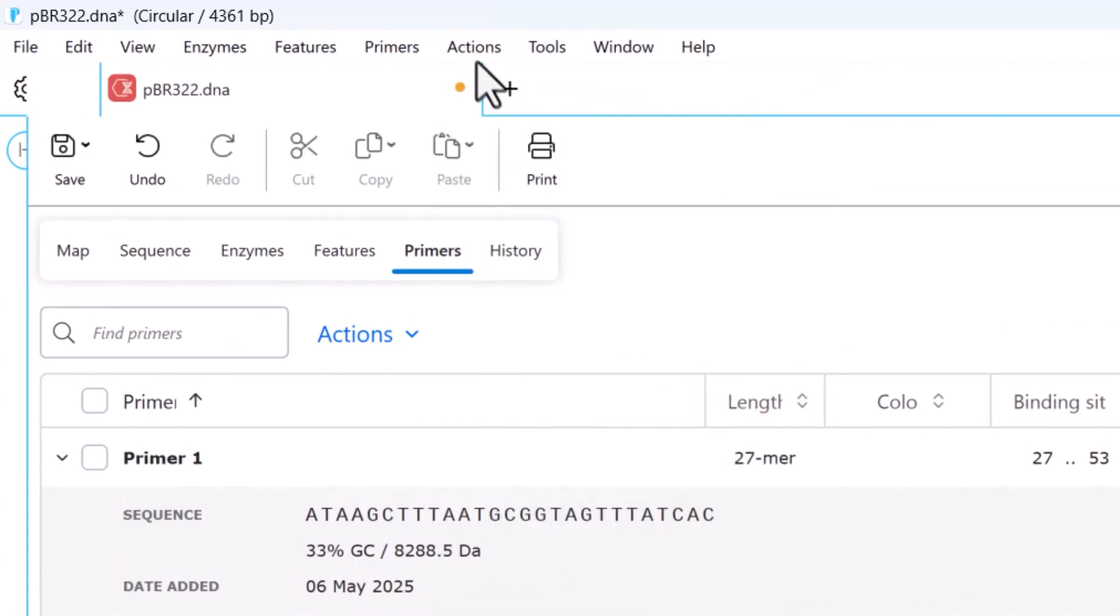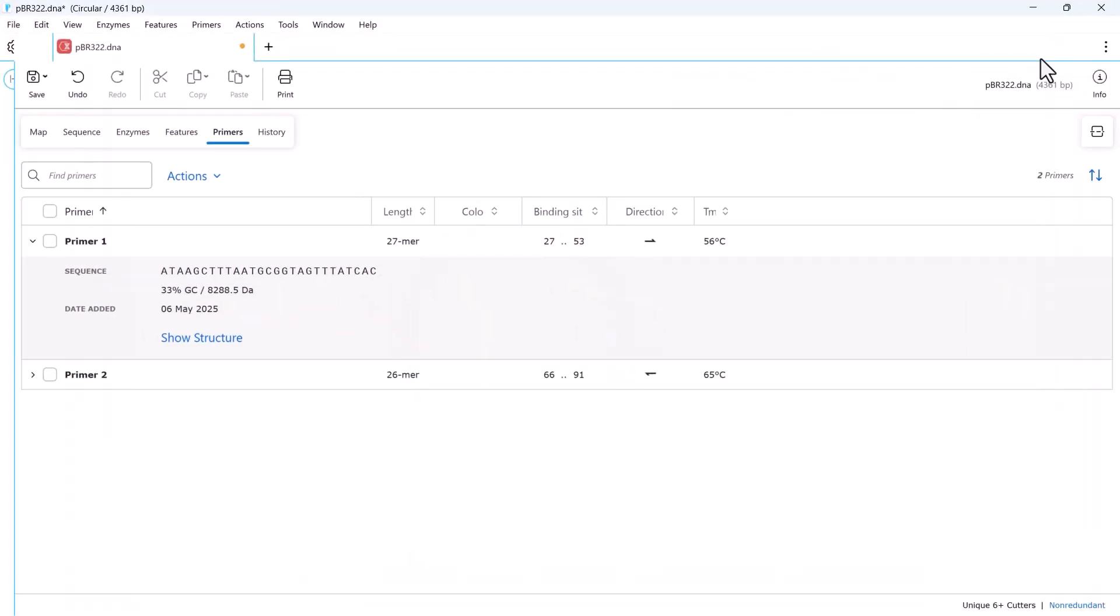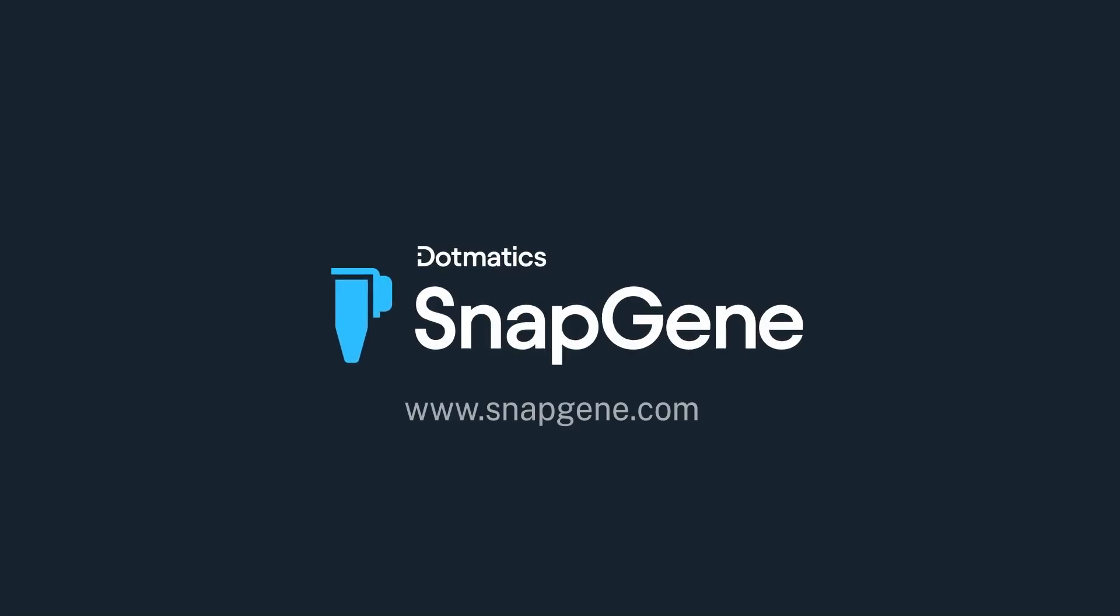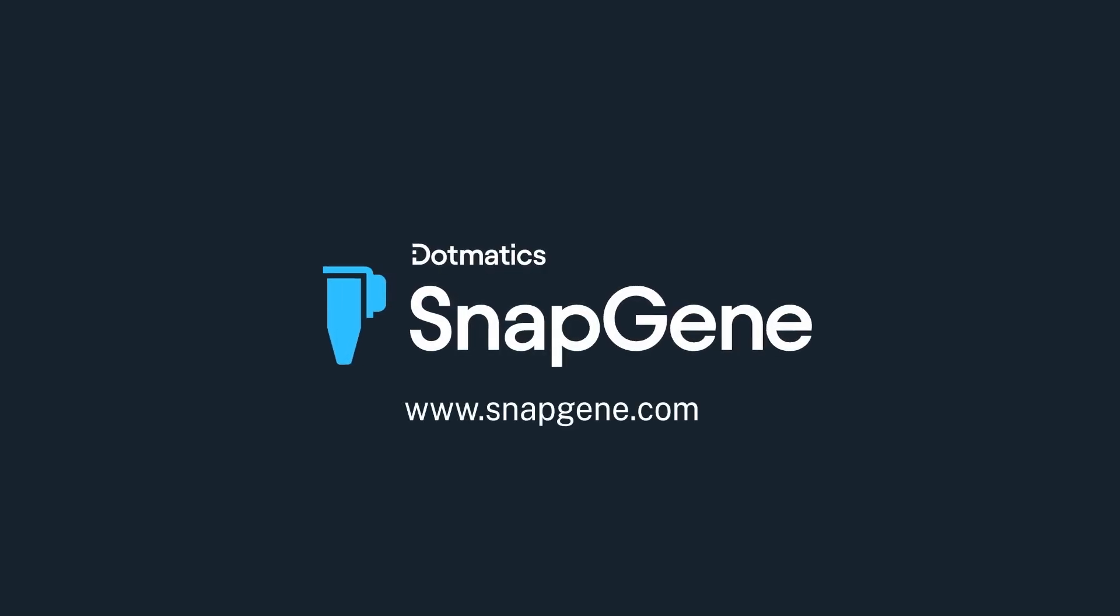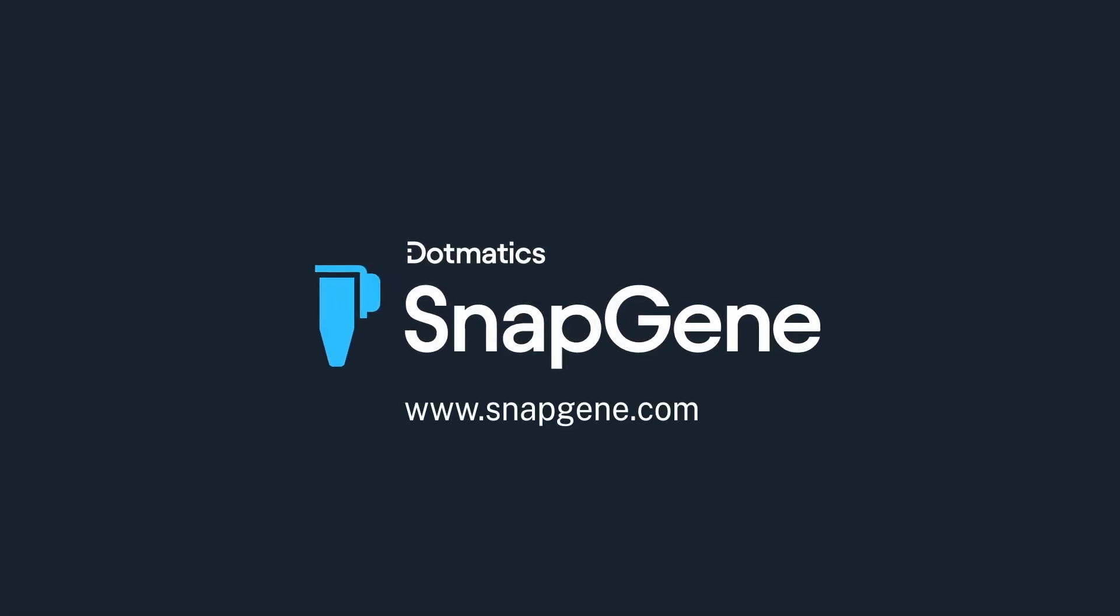And that's how to work with annotations in SnapGene. To learn more, visit SnapGene.com.